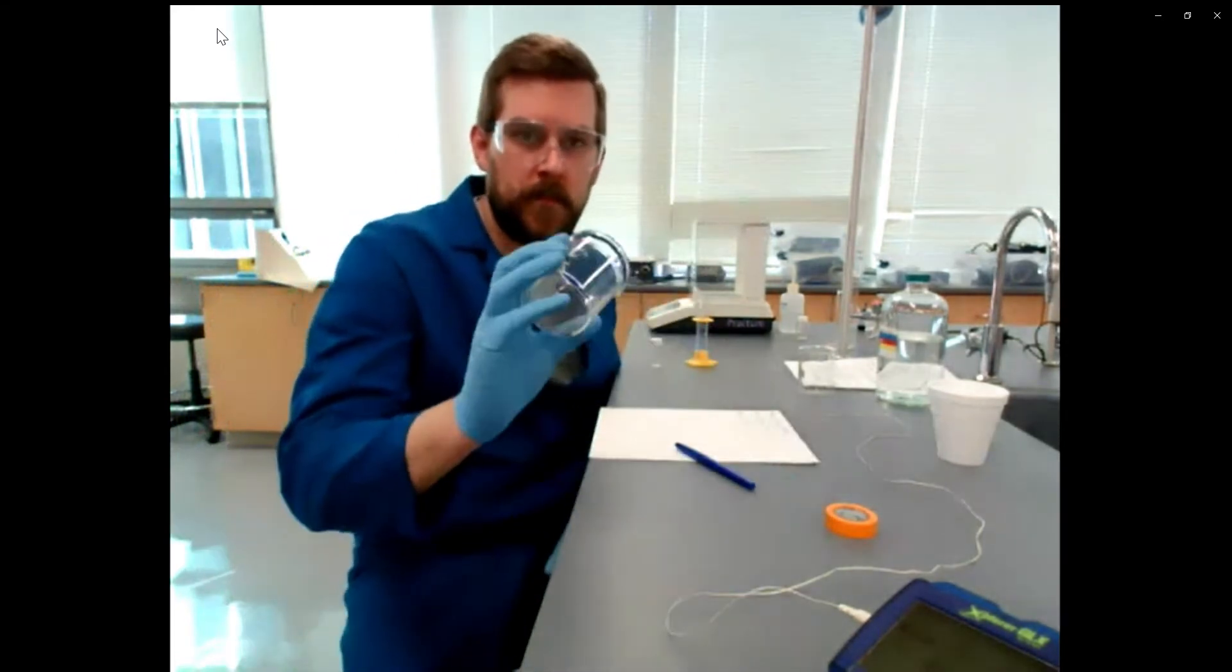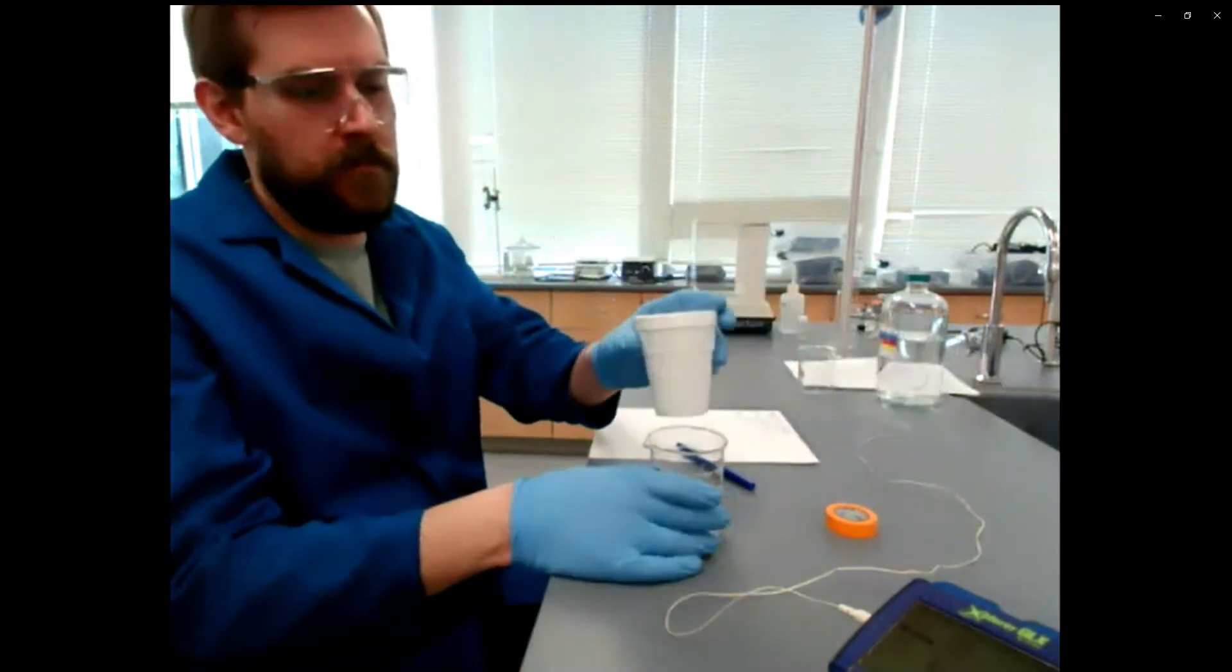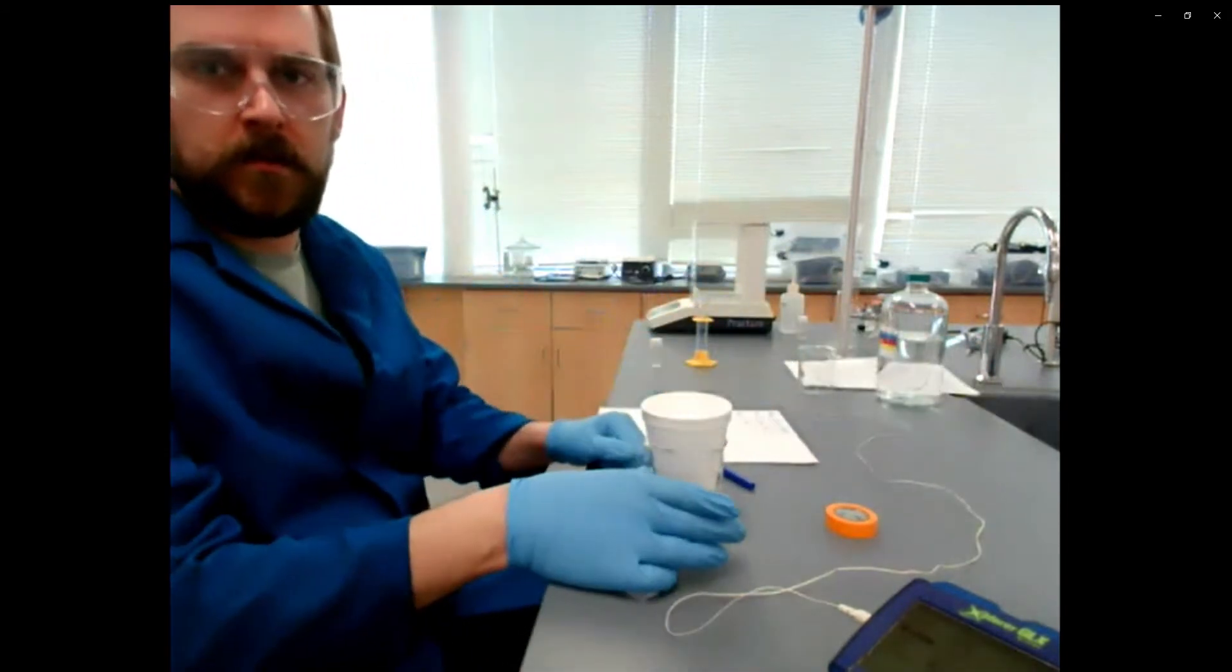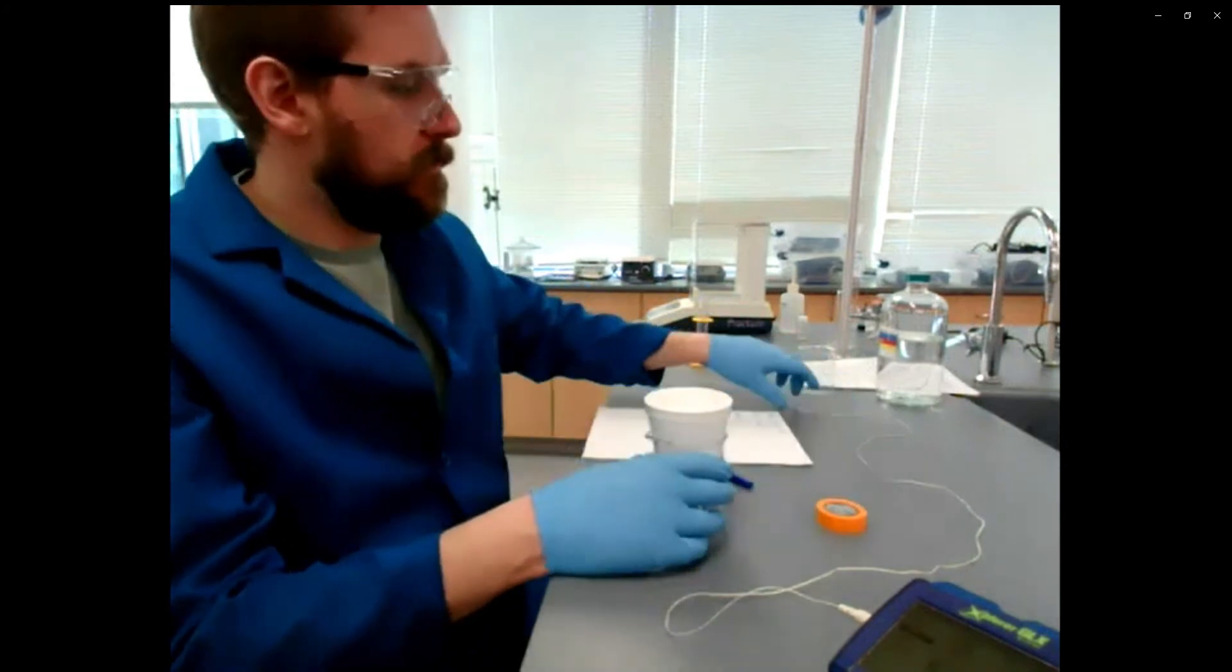First thing is we have to assemble a calorimeter using a beaker and a styrofoam cup. So we're putting the styrofoam cup in the beaker, tapping it in. And then the point of the beaker is to hold it without transferring a lot of heat from your hand.